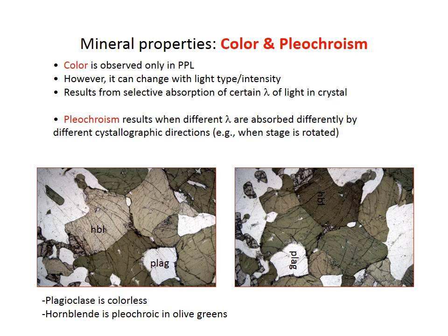And you can actually, if you pause here and look closely, you might be able to see the amphibole cleavage in the hornblende crystals. There are a lot of cracks, some of them are aligned, and some of them make nice little diamonds.